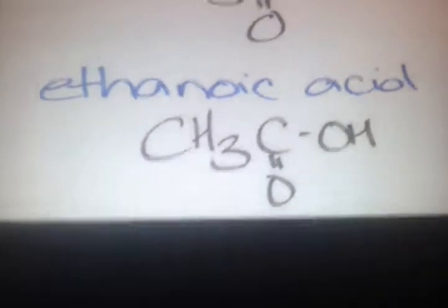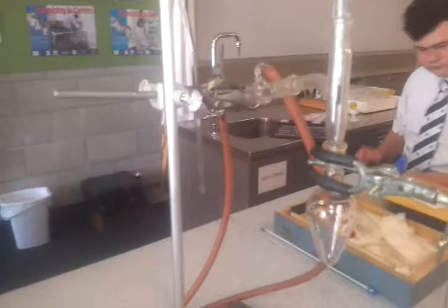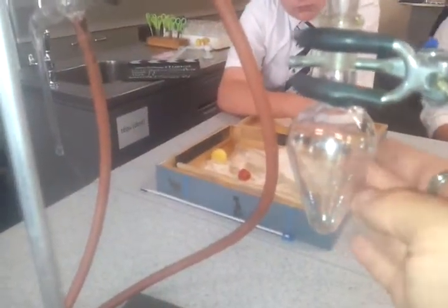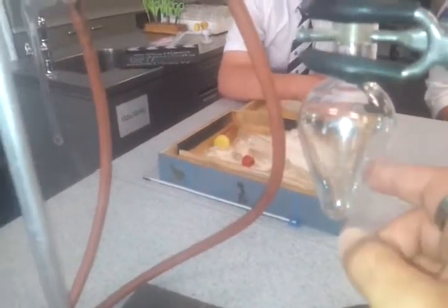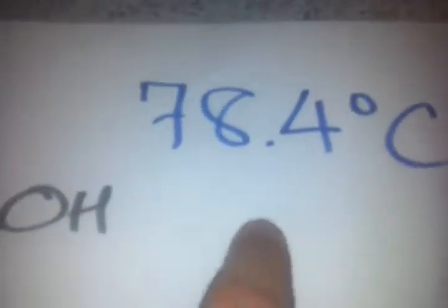So when we heat it up, we don't want to boil off the ethanol because we need it to react, but we want to get it hot enough that we can collect the ethanal. So for this, we would use distillation. What we're going to do here is have our oxidising agent, such as acidified permanganate, in here. You'd have ethanol, and then of course you'd heat it. We'd heat it until the reading on our thermometer was about 70 degrees Celsius. Hot enough to actually react, but not too hot for the vapours to be primarily ethanol, because if they were, then they would escape.